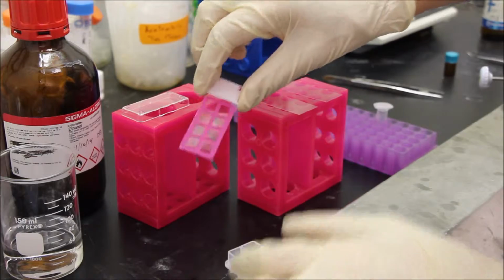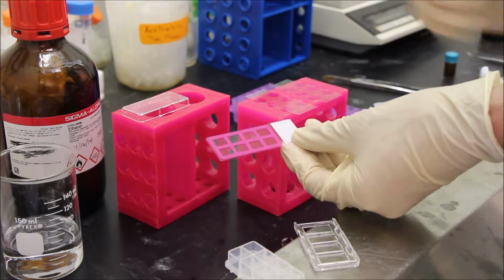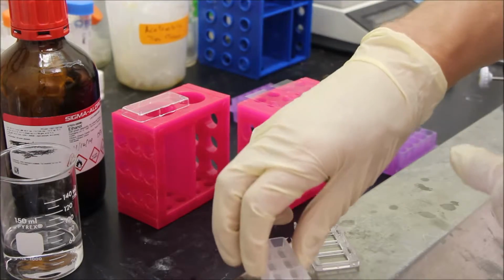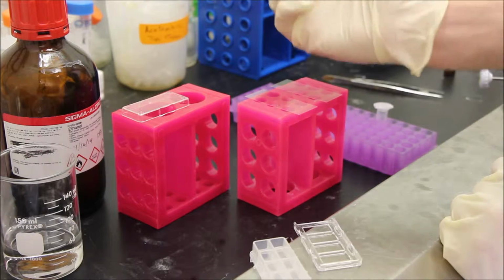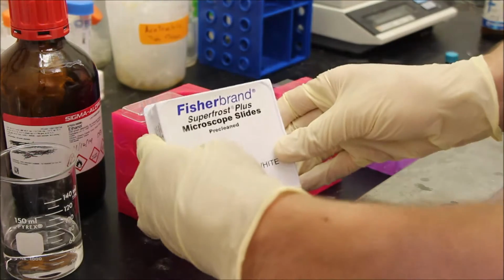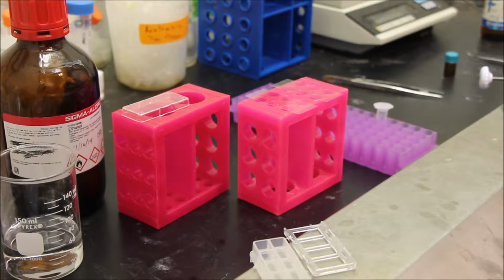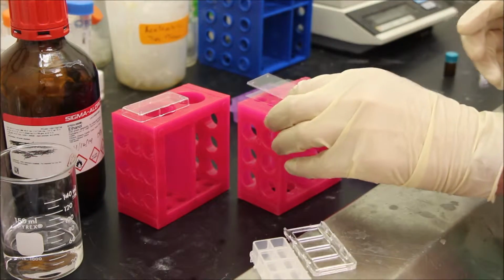And this is the bottom glass slide. Now typically this pink section is a hydrophobic coating which keeps liquid in its respective spot. We won't need this. I found that the gasket on the bottom of these wells is sufficient. We will eventually be putting the monomer solution with the catalyst on top of these cover slides, and then be using a microscope slide, which I have been using the Fisher brand Superfrost Plus. It's cleaned in such a way that it improves the gel attachment to the glass slide, and once the solution's put on there, you'll see in a bit, we'll sandwich it between these 2 pieces of glass.